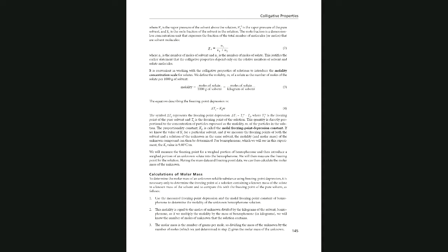But I also explained that there are three formulas I'm using. These are TF and TI, the final temperature, the freezing point of the solvent and the freezing point of the solution. So with the two temperatures that you get by experiment, you find delta TF. Kf is a given number, and you find lowercase m. When you have the lowercase m, you plug it into this formula. Because you have the kilograms of solvent experimentally, you find the moles of the solute. When you have moles of the solute, molar mass equals mass over number of moles, so you can calculate the molar mass.